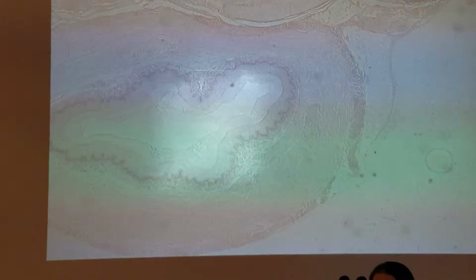And then the very outer layer, which we hardly ever get to see, is the adventitia. It's also known as the serosa in the other digestive organs. But if it was ever pointing to the very outside edge, that's when you would want to choose adventitia. Of the 50 questions, not usually a popular one. And it would only be adventitia on the esophagus slide.